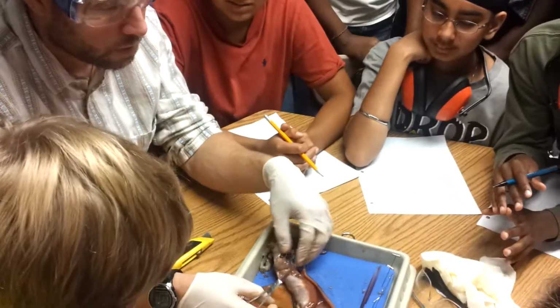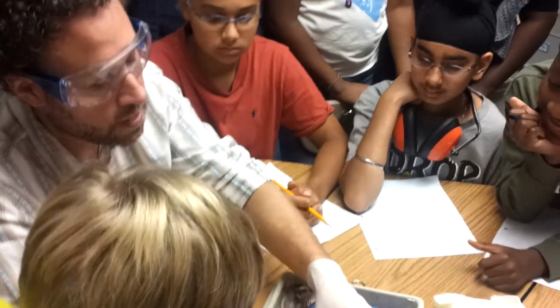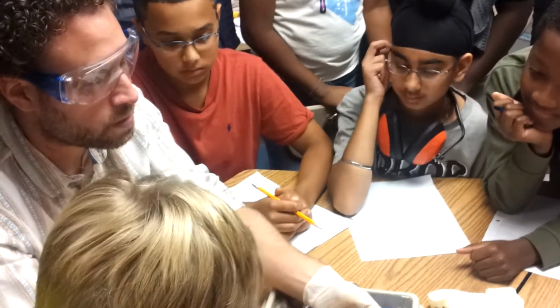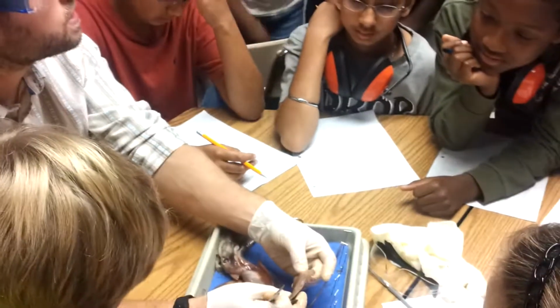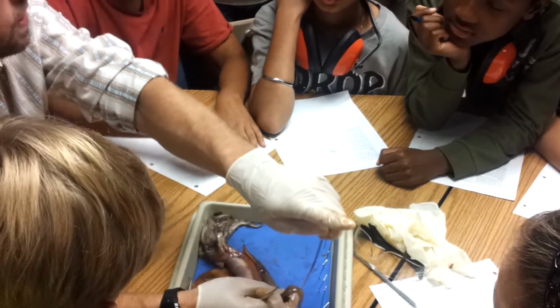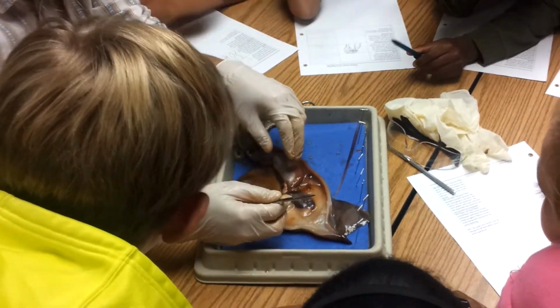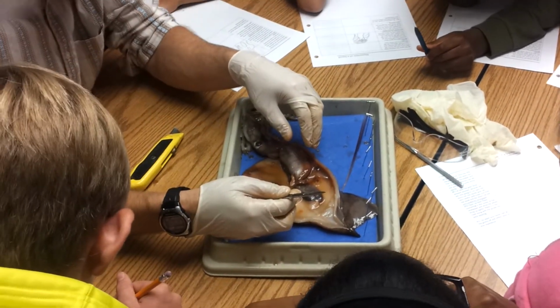Okay? Do you want me to stop? No. Okay. Now, the other way it propels itself is up here you've got these fins, which it uses to swim and to steer. It usually is going to swim backwards. This is the point, the end that goes forward. And the tentacles are going to go backwards because you can imagine if you're trying to go forward, they would flop all over the place. There's something under the skin. Okay? Right there. It's a ball. Okay? Now, what's our next step? Number 10, clean up. Oh, okay.